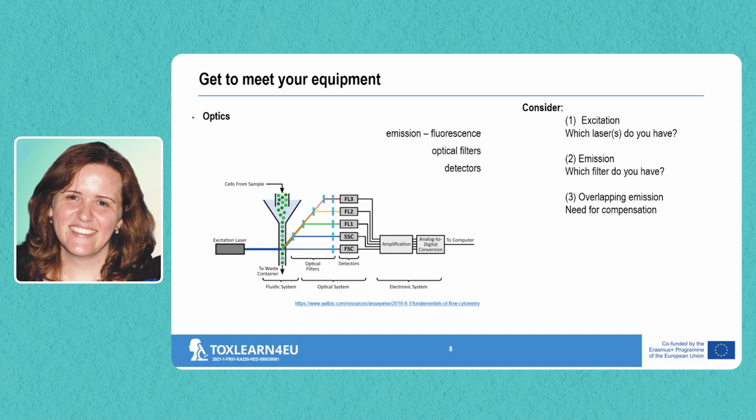If we use more than one fluorochrome in our methods, we can have emissions at very close wavelengths. So we have the possibility of having something like this.